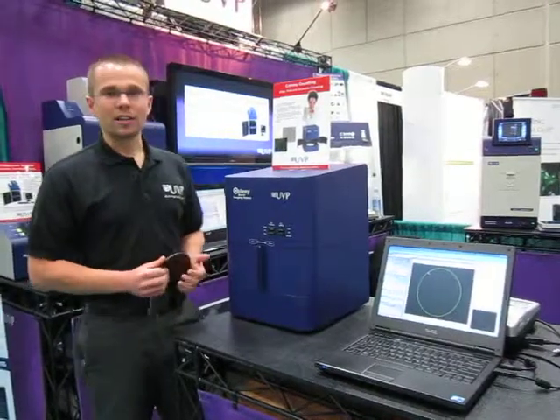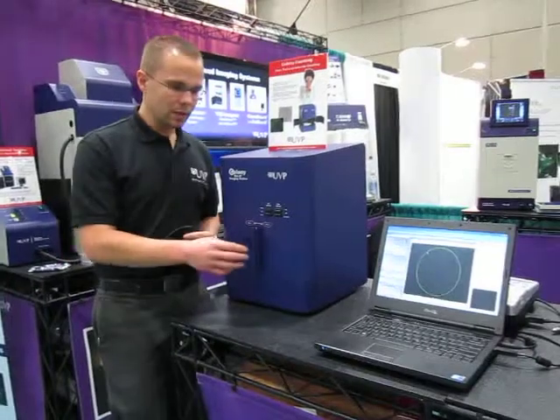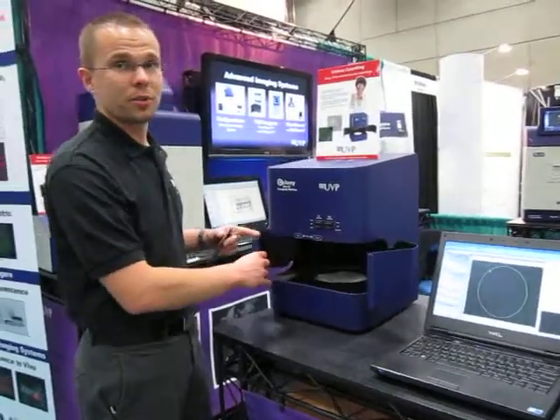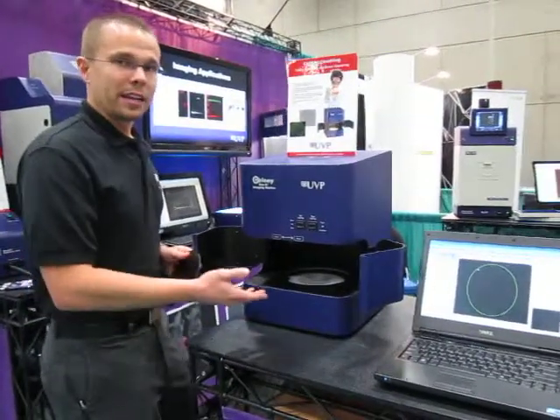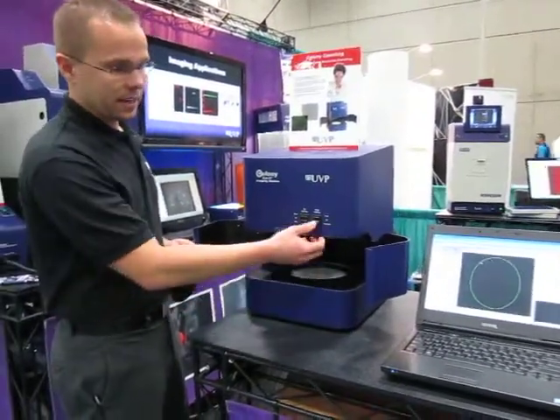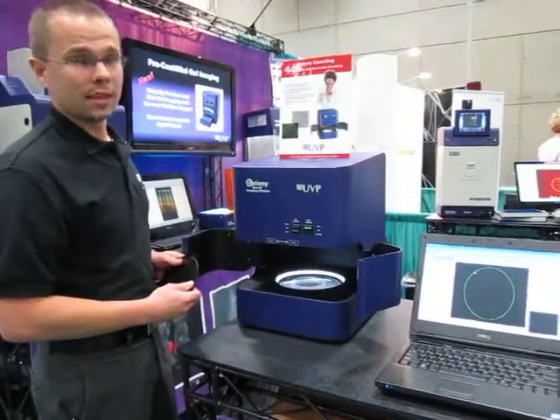Today we're showing off our Colony Docket Imaging Station, so I wanted to show you a little bit about the system. First of all, the system integrates two doors so you can create a darkroom environment for counting colonies. There are different lighting options within the system. Base lighting includes trans-illumination of white light as well as dark field lighting for spiral plates.